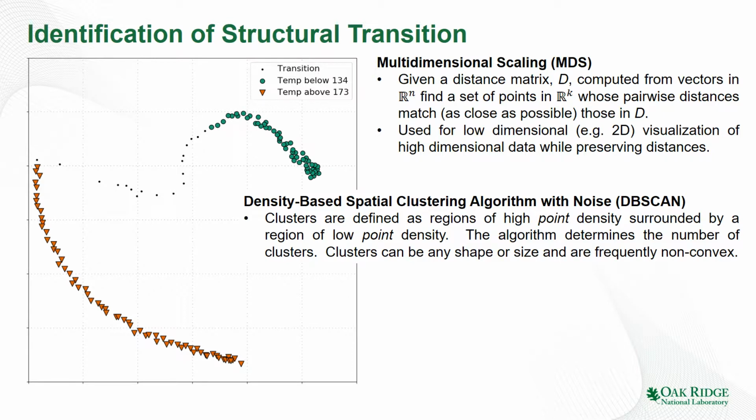Next, I clustered the data using an algorithm called DBSCAN. DBSCAN works by grouping areas of high point density as clusters. Points that are not in the regions of high density are considered noise. The user need only specify what dense means in context. DBSCAN has several advantages. In this case, it's most beneficial because it doesn't make any assumptions about the shape of a cluster, and it allows for points to remain unclustered.